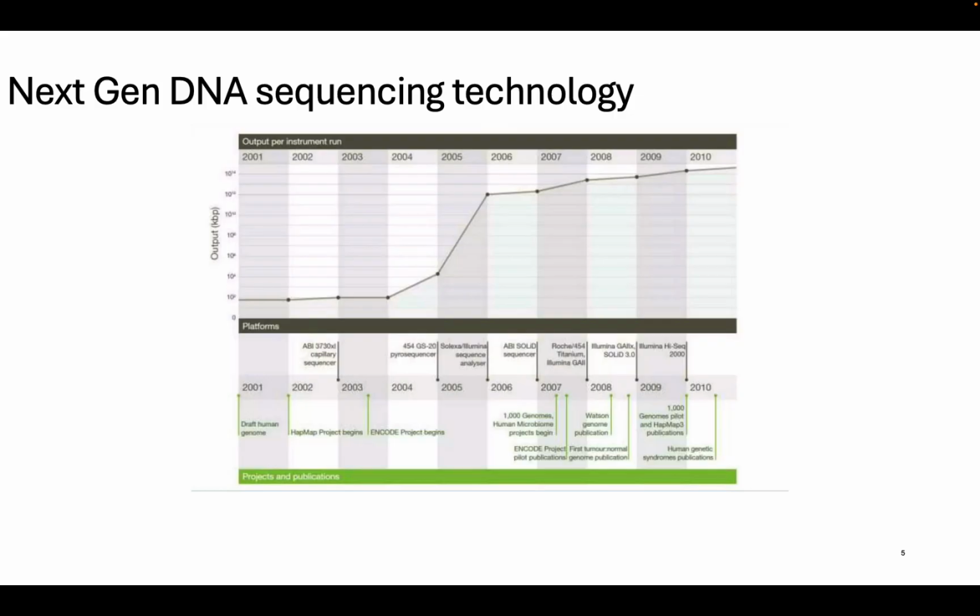whole genome, you fragment it into a bunch of small pieces, and you start to sequence it. There were a handful of different companies that were trying to do this. The 3 are right here. And really the winner ended up being Illumina, and we still do Illumina sequencing today. So we can call this either next generation sequencing, or sometimes we call it second generation sequencing.